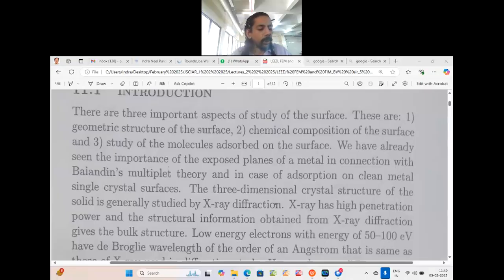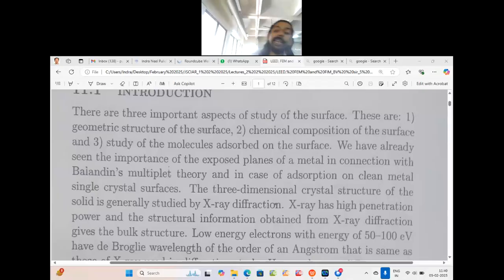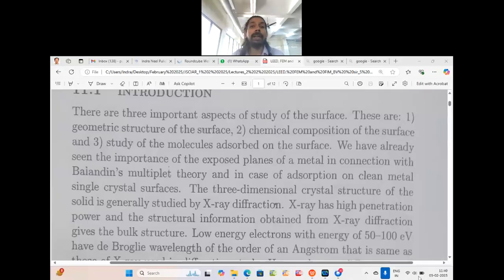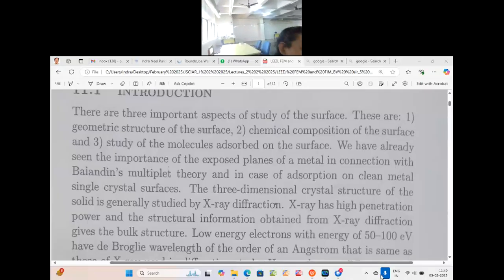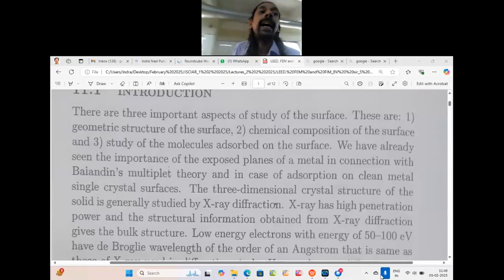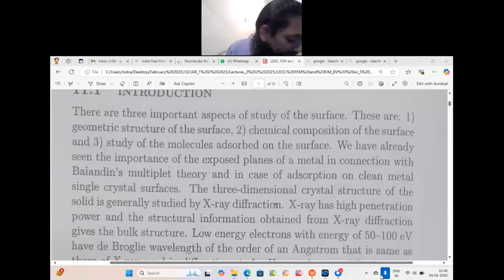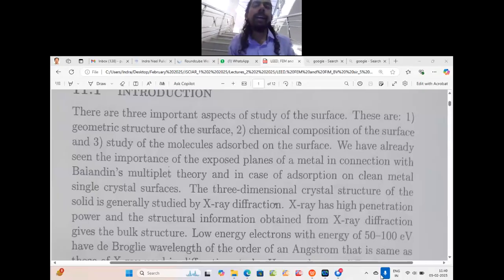Likewise, from the 2 theta, we get useful information related to the interplanar spacing, that is the d value. Another thing that we can deduce from the X-ray diffraction pattern is the crystallite size. We have the Debye equation, and this Debye equation deals with the determination of crystallite size.